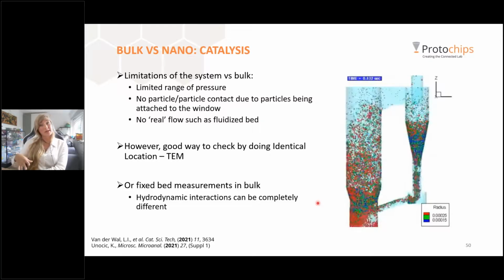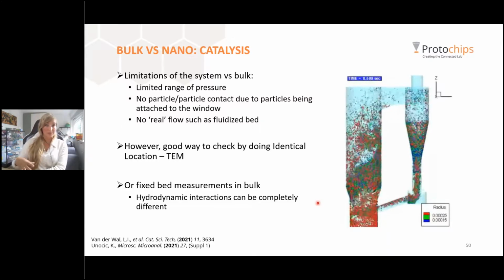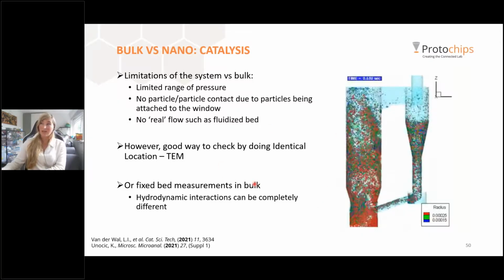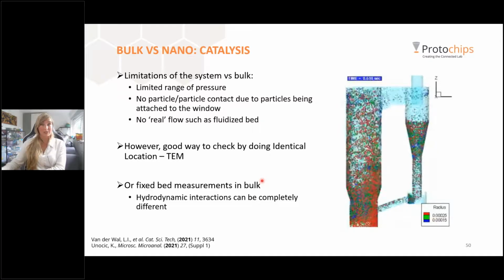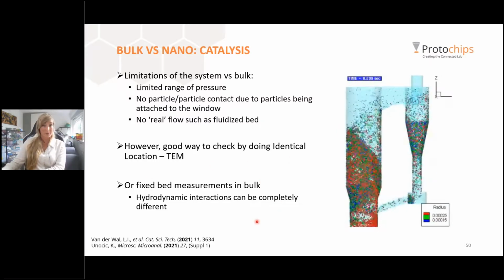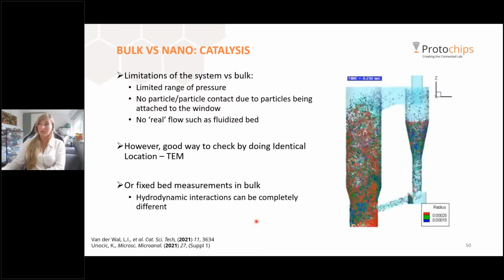It doesn't look exactly the same. However, it's always great to do identical location TEM, where you, for instance, take a chip and put your sample on top and put it in a normal reactor to observe what kind of difference it makes to have a chip in a reactor compared to a chip in a holder. Or if you really want to compare it well, use fixed bed in your measurements compared to your chip.